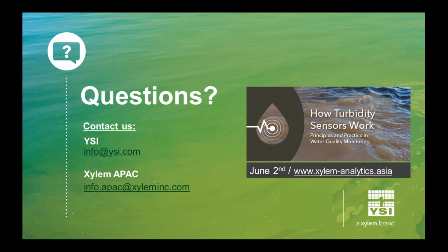Well, that's a good question. Strong winds, if I had to guess, and obviously I don't have a lot of information to work on here, there could be a few effects of the winds when it comes to algae monitoring. And it does depend a little bit on what you mean by abnormal data. But I'm going to assume what you mean is fluctuations in your RFU readings. Most definitely, strong winds and currents move the algae.